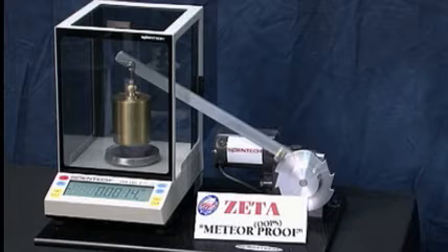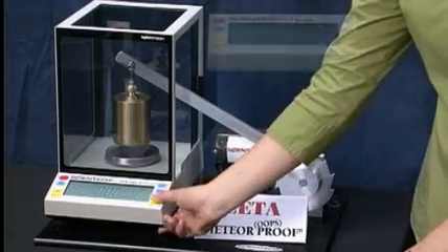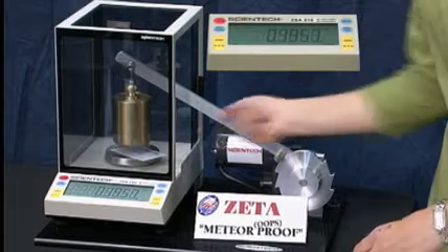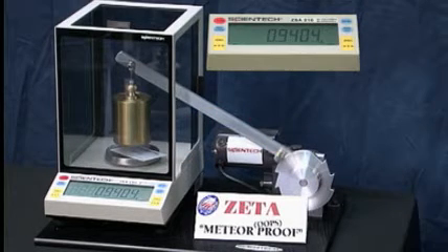We'll place a business card onto the weighing pan, zero it out, and see that it weighs 0.9399 or 0.9400 grams.